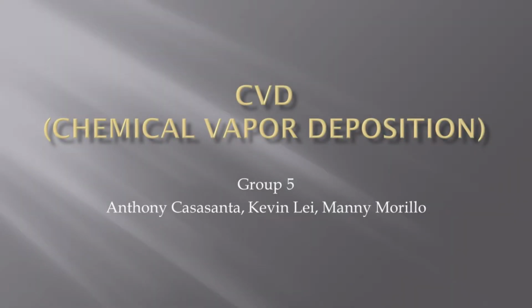Hello, we are Group 5, and this video will outline the motivation, objective, theory, procedure, and results of the Chemical Vapor Deposition Lab.